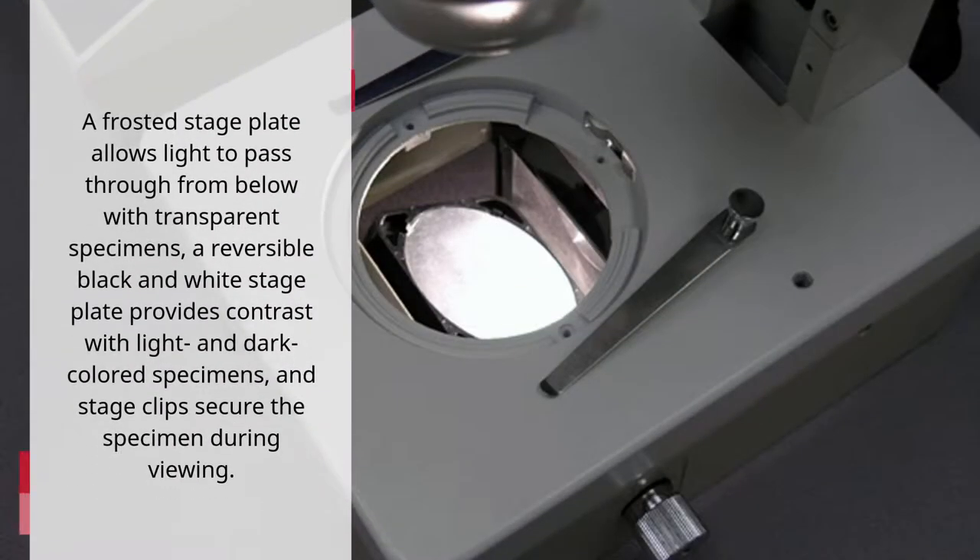A frosted stage plate allows light to pass through from below with transparent specimens, a reversible black and white stage plate provides contrast with light and dark-colored specimens, and stage clips secure the specimen during viewing.